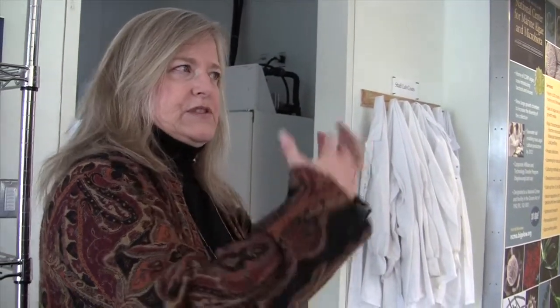So this is where we now have up close to 4,000 strains of algae growing in chambers, growing at different temperatures depending where they came from. Researchers send us samples when they're out at sea. They're all cataloged here. We have curators who keep them growing. Some of them need to be restarted every couple weeks, some of them every couple months. So it's a really intensive process.